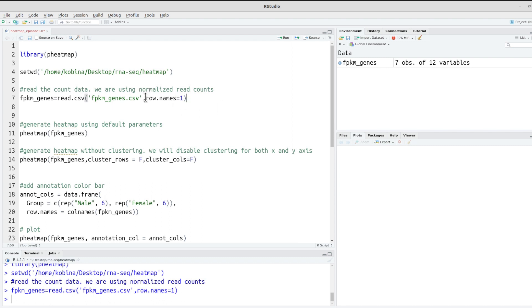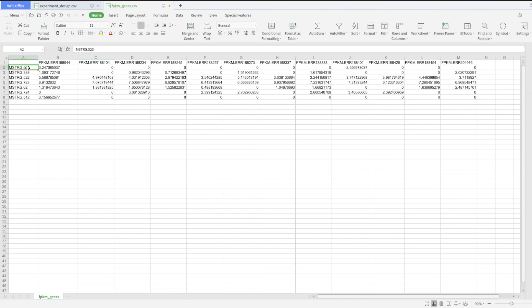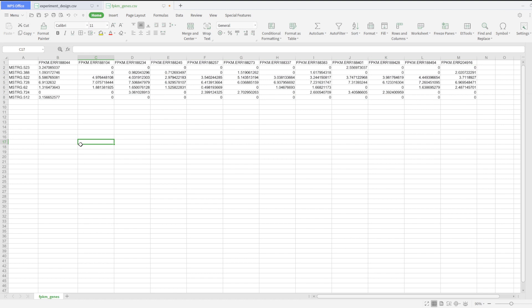I have read the data. Notice the parameter row.names equals 1 — I am using one of the columns as the index. So that column will be my row names, and the remaining columns will be the actual data. I'm doing this so that I can get my data in the proper format before feeding it to the pheatmap package.